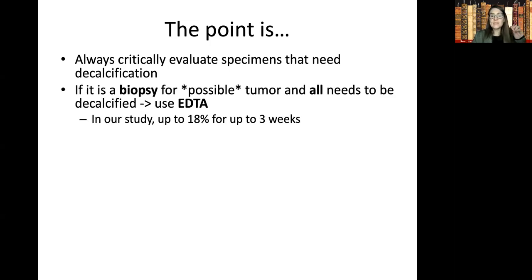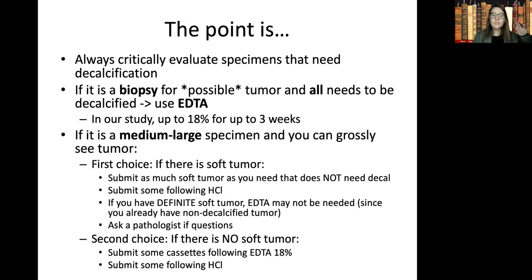If it is a biopsy for possible tumor and it all needs to be decaled, remember, please use that EDTA. In our study, up to 18% EDTA for 3 weeks was totally fine. If it is a medium to large specimen and you can grossly see tumor, then of course, if there's anything soft, just submit as much soft as you can without decal. You can submit some following HCl if you have soft. If you have definite soft viable tumor, then you may not even need EDTA, right?